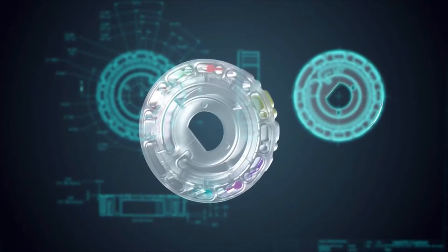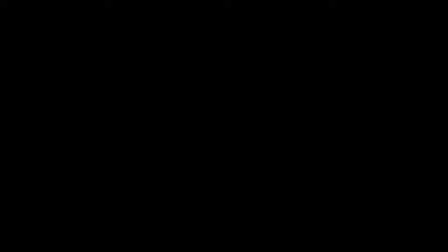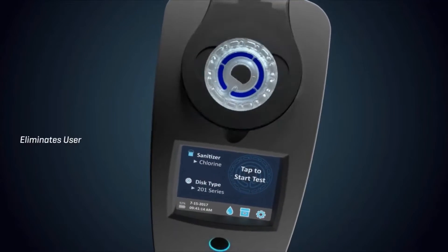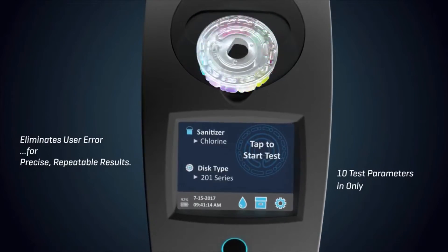Reagents are dispensed into specially designed wells, mixing beads are inserted, and the disc is sealed. The unique fluidics disc eliminates user error for precise, repeatable results in just 60 seconds.